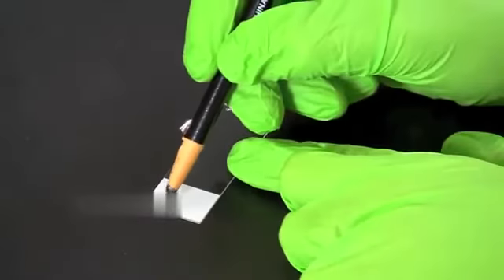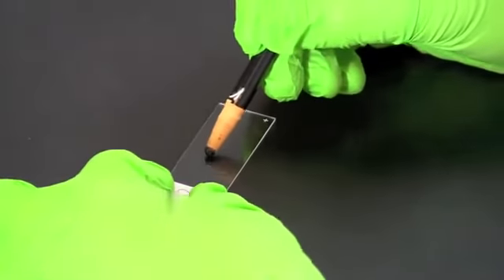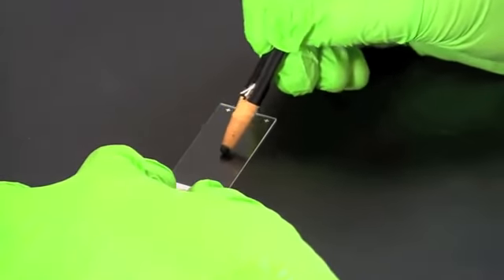Using a wax pencil, label a microscope slide with your initials. Then draw a circle about 1 centimeter in diameter on the slide.